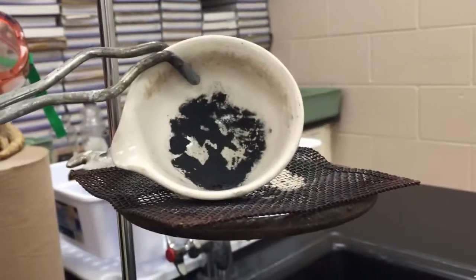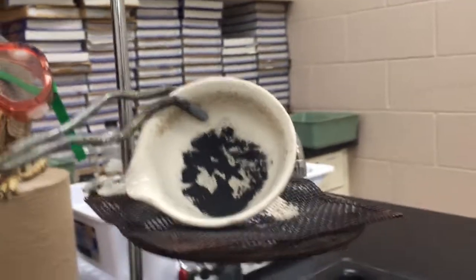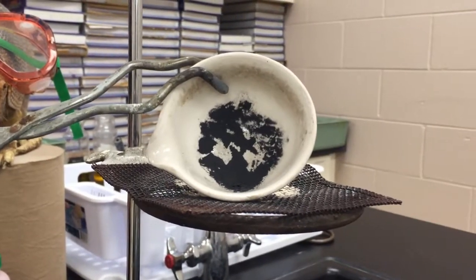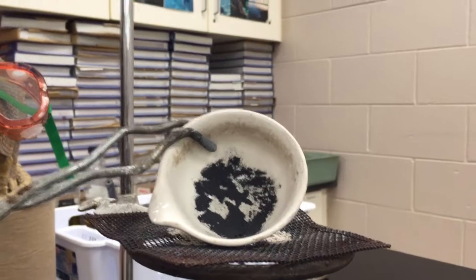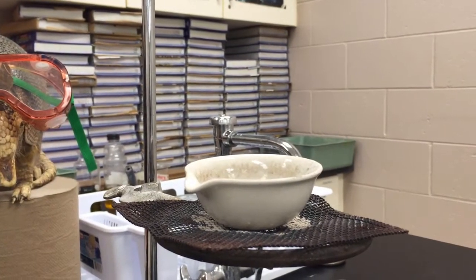And what you're seeing in front of you is a brand new substance that has been made, and the name of that substance is copper oxide. It's a black powder. I don't know if it's copper 1 oxide or copper 2 oxide. We could do confirmative tests to determine that with mass relationships. But that wasn't the scope of this because I don't know exactly what the mass of the original powder was. We're just looking at relative changes.